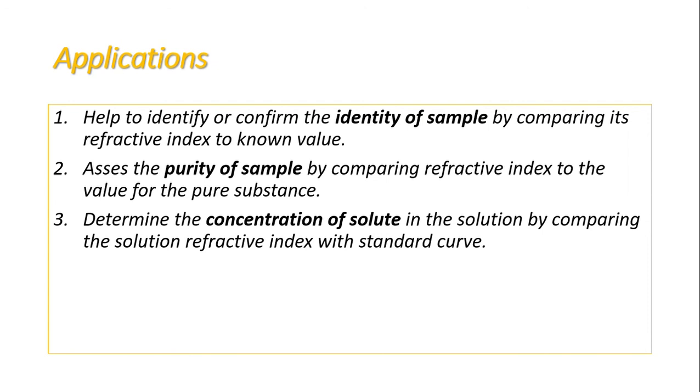Finally, the applications of RI. It helps to identify and confirm the identity of a sample. How? By comparing the refractive index to a known value. We have a reference cell and the sample cell. We compare the sample cell with the reference cell and know the identity of the sample.